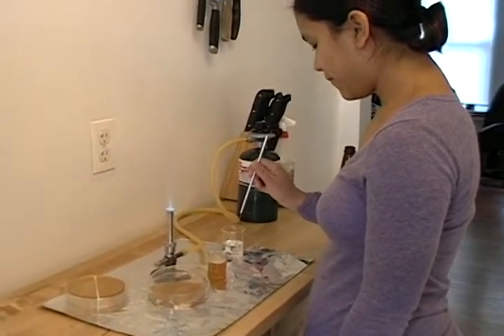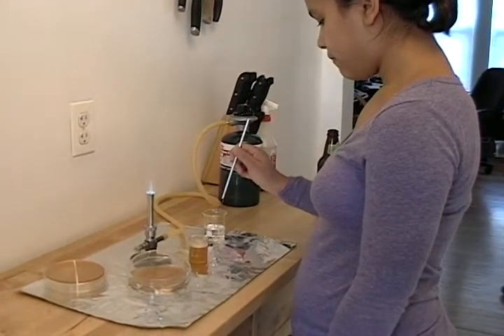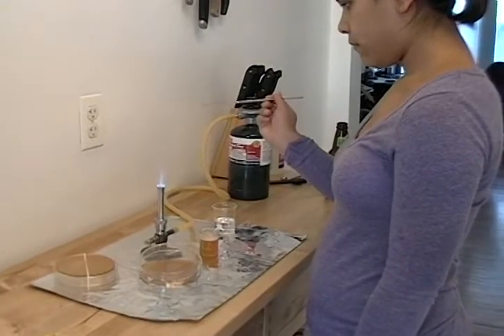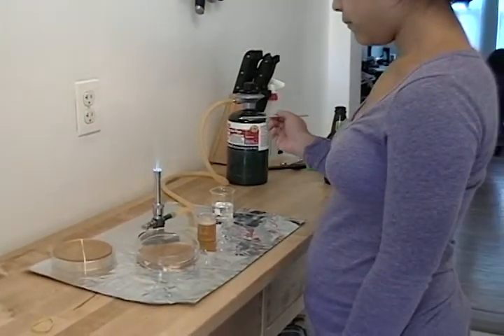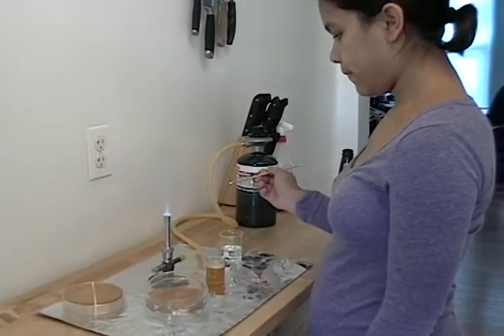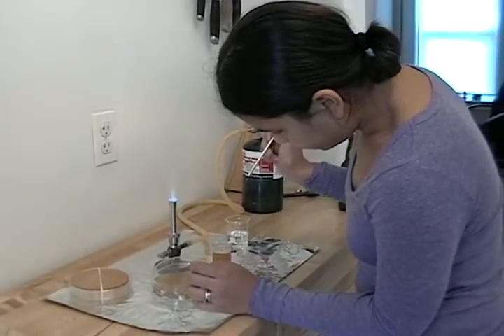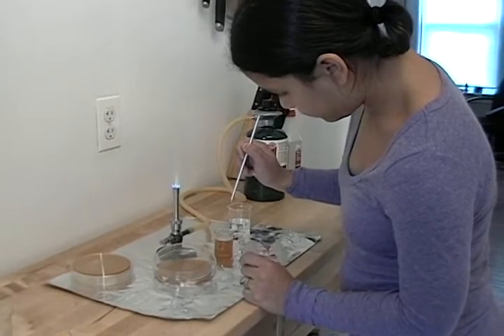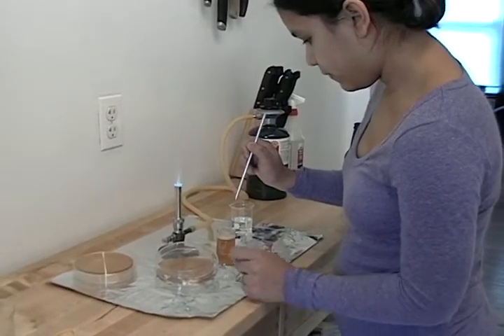Now Lade is going to demonstrate how to streak out a plate. So the beaker he's using right now is just alcohol for quenching. She's got the inoculation loop running it through the flame. She's going to get a little bit of the yeasty beer on the inoculation loop.